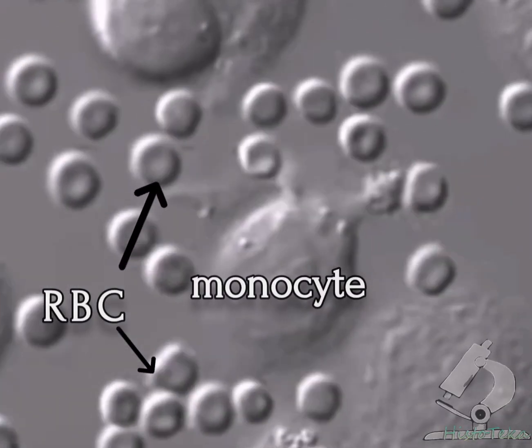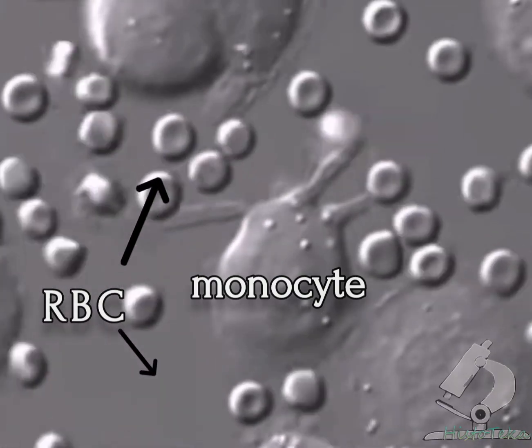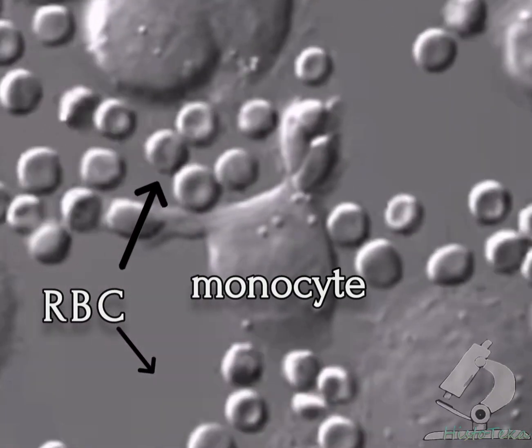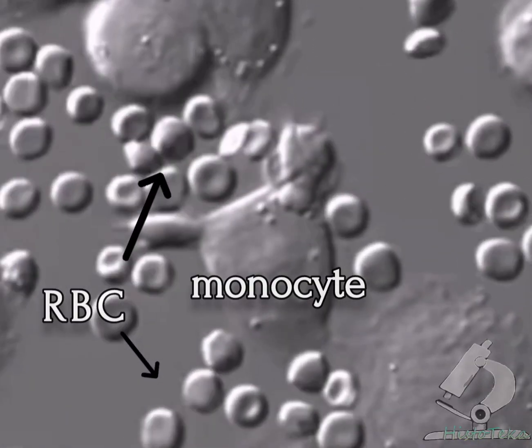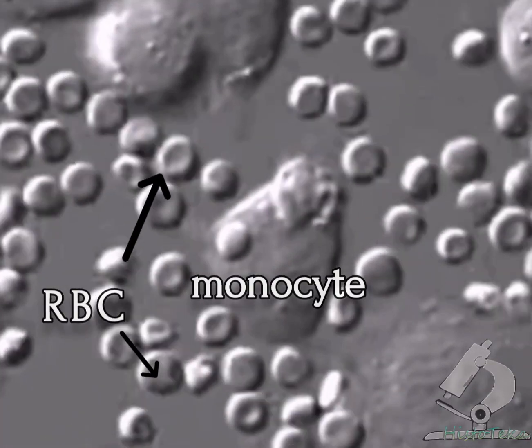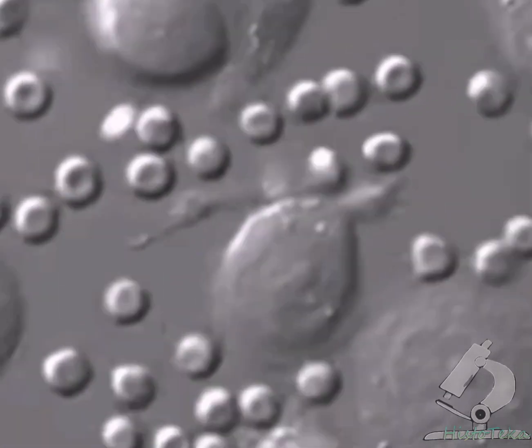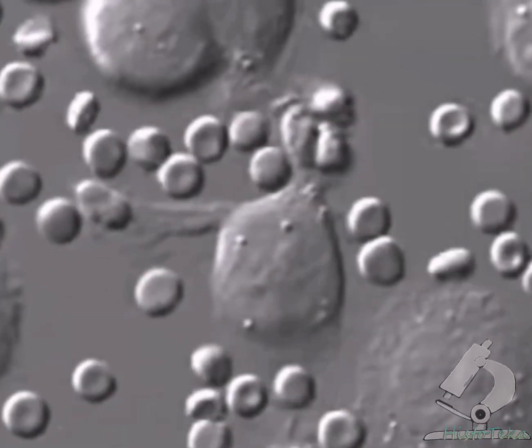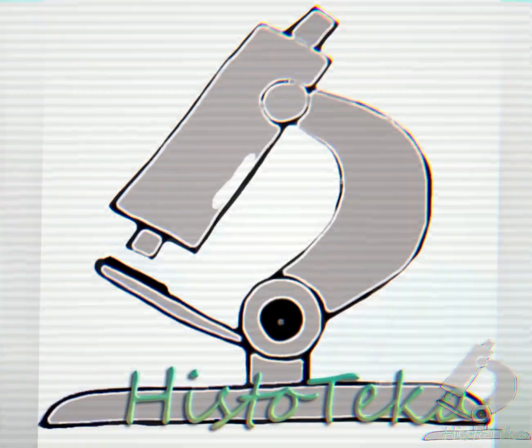Monocytes are the transport form of macrophages. Moving out of the bloodstream into the surrounding tissues, they can turn into typical or resident macrophages, for example, Kupffer cells in the liver, interdigitating and dendritic macrophages in the hematopoietic organs, and nurse cells in the red bone marrow.